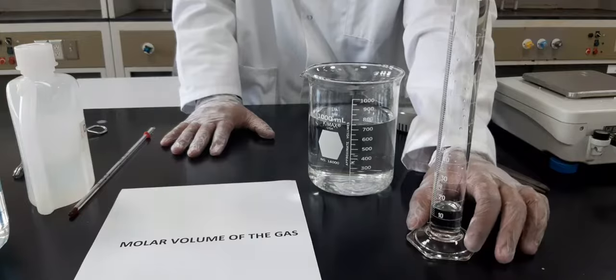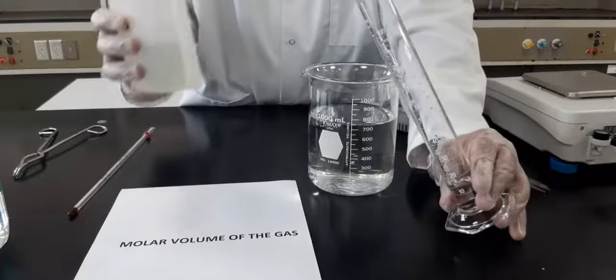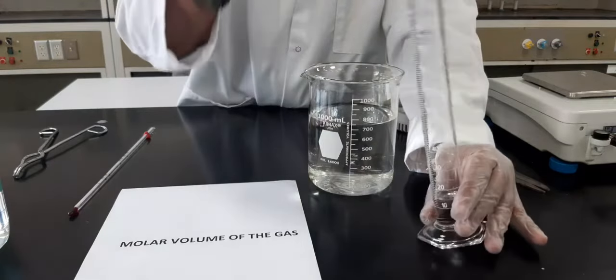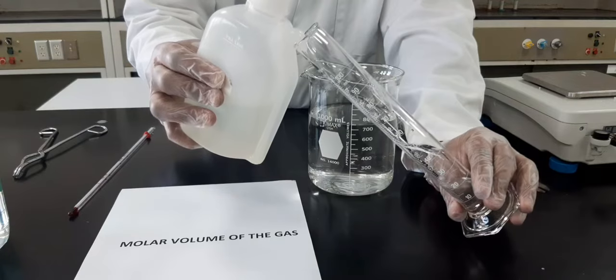Now I'm going to put distilled water to make it up to the mouth. While you're putting this distilled water, it is recommended not to put it in completely straight, rather tilt it and start adding water.